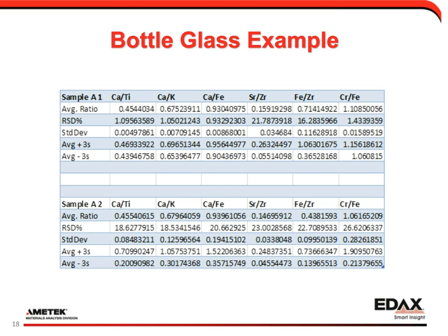From here, the comparisons can be made between the various glass samples. Of course, if they fall within the plus or minus 3s, then they could be concluded as being the same. And if it falls outside, then they can be concluded as not having the same composition.